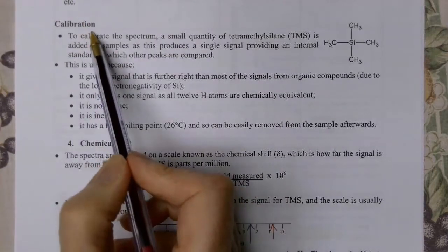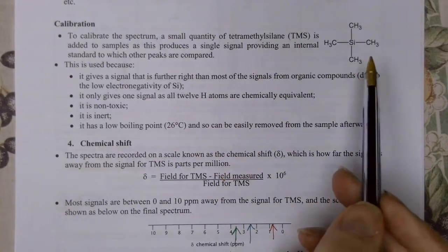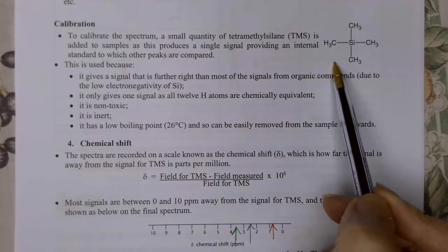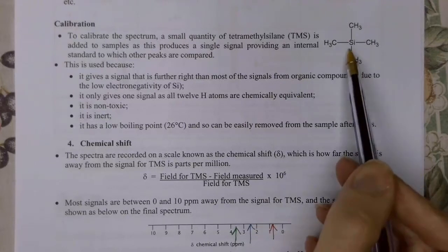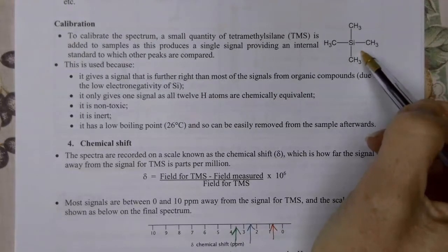To calibrate the spectrum, we use a small quantity of what we call TMS. This is tetramethylsilane. The reason we use this is it's got 12 hydrogen atoms. They're all in the same environment, so they're going to give me one clear signal. It's non-toxic, it's inert, it's easily removed, and it also tends to give us a signal further to the right than most signals. Most other signals are going to be to the left of this one, so we set this value to be 0.